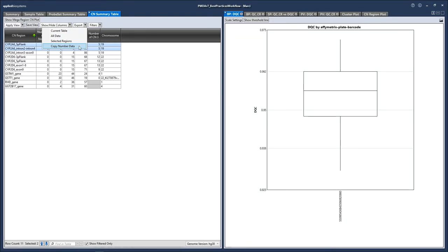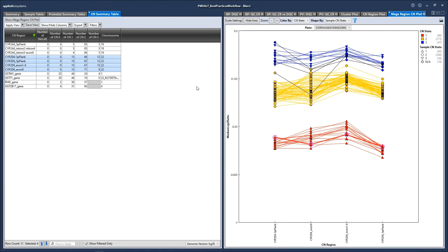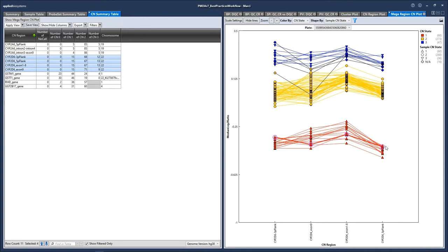Let's also look at the mega region CN plot. This is a way to display multiple fixed regions at once — they just all need to be on the same chromosome. So let's select all the CYP2D6 regions and click show mega region CN plot. On the right side of the screen, we see the plot with each of the fixed regions shown on the x-axis and median log2 ratio on the y-axis. Each point on the plot is a sample, so I can click on a single sample and follow it throughout the plot. I can see that this sample was given a copy number state of 1 for each of the fixed regions for CYP2D6 markers. If I had multiple plates run in a batch, you could select different plates here, but this graph will always show one plate at a time.